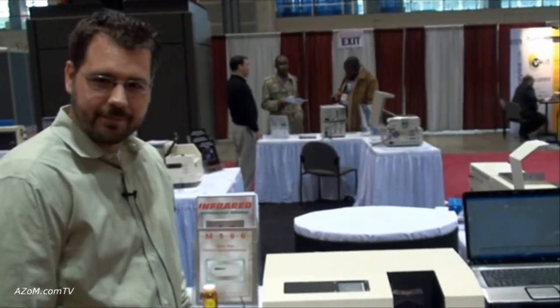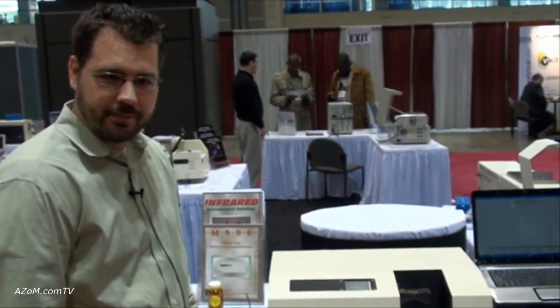All right, Scott. Thanks very much for the tour through the 530 infrared spectrophotometer. Thank you.